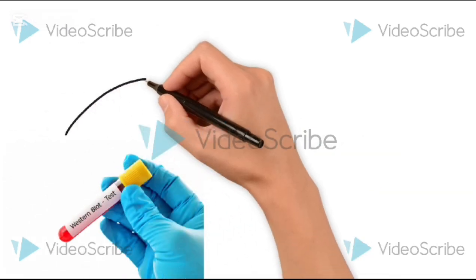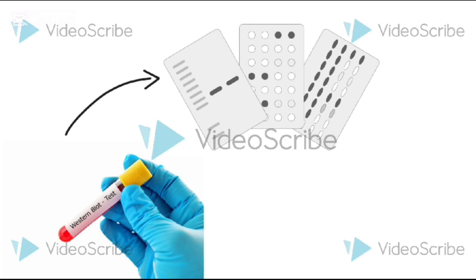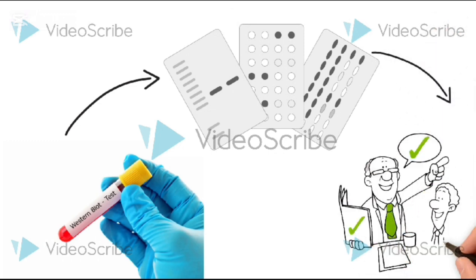In conclusion, the blotting test gives more quantified information about the analyte or the occurrence of any disease in a sample or a patient.